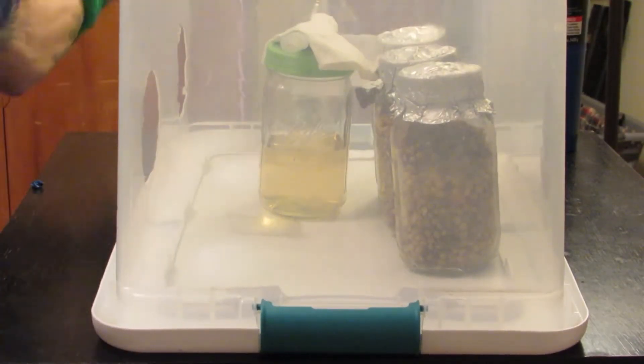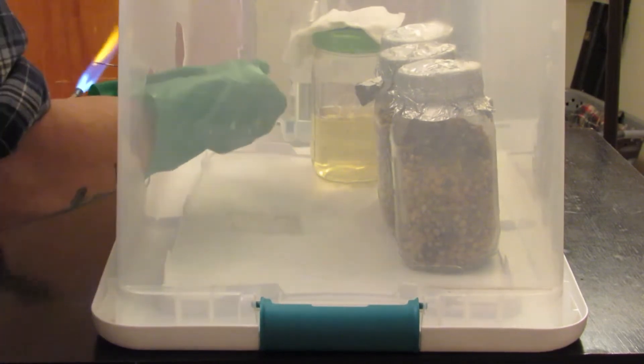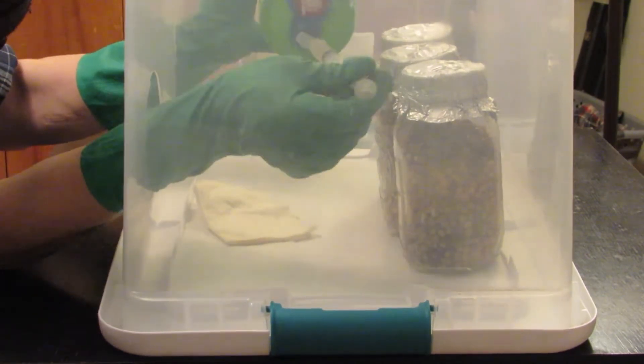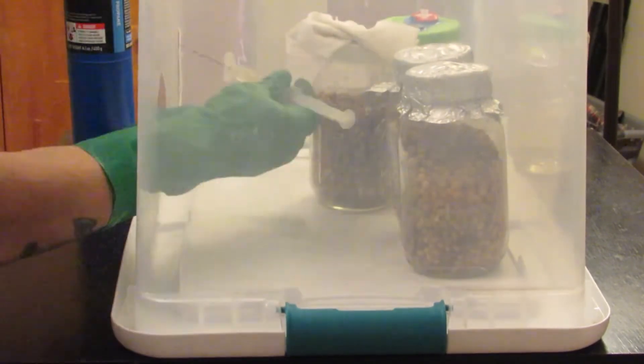As you can see here, I have a standard still air box set up. Nothing special about the jars. I use your standard self-healing injection port, and to flame sterilize my needle, I'm using a propane torch you can get at the plumbing section at Home Depot for about $25.